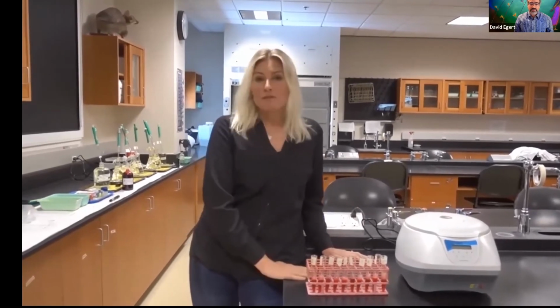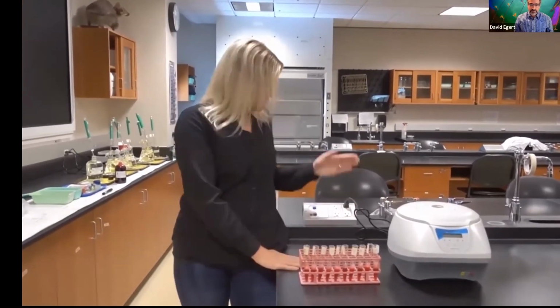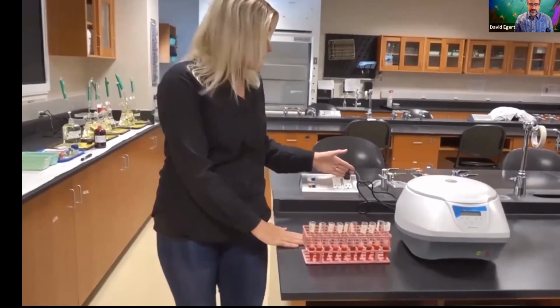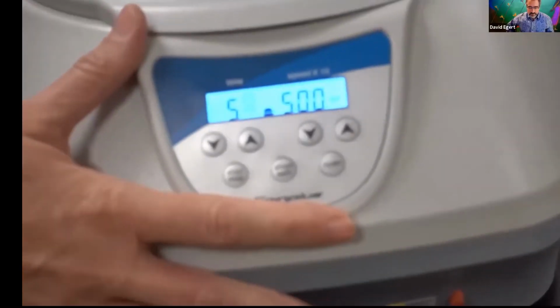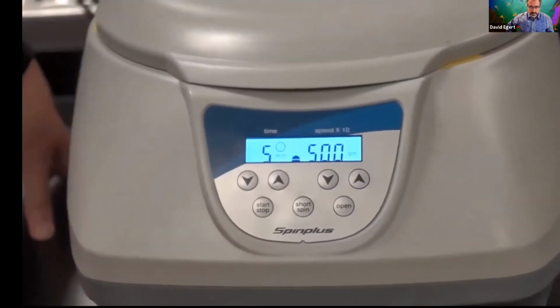But let's start off with how to use the centrifuge. Number one, make sure it's plugged in. Number two, on the back side of the centrifuge, you have a switch. And so now it's on right there. And then once it's on, the display will light up, and it should already be set on the settings that you need.